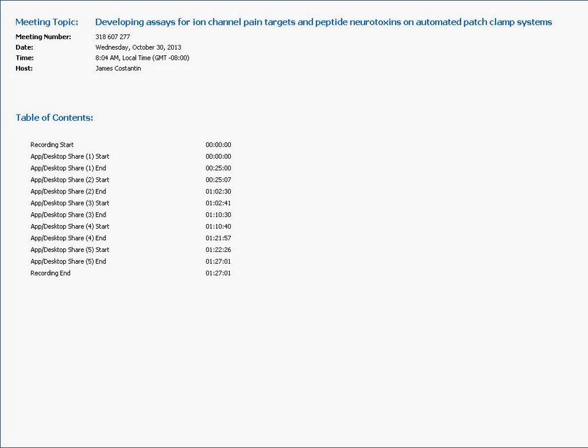Before I get into the data, I'll give you a quick background of what this toxin does. Back in 2004, they tested this compound on the Shaker channel, and they found that it slows activation and decreases the overall current. This works pretty well in micromolar concentrations. They also showed that it decreased the gating, where you see a drop from the small line to the thick line, which is 5 micromolar of BRMT.